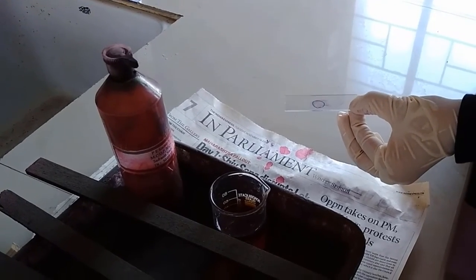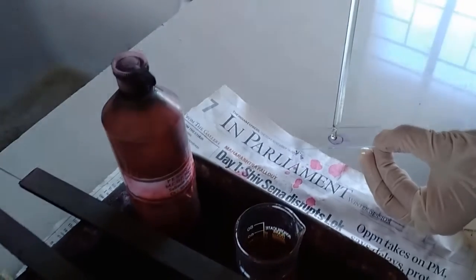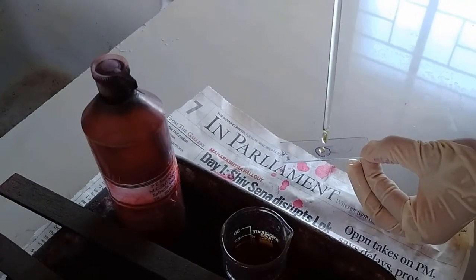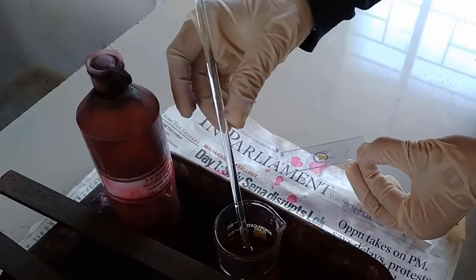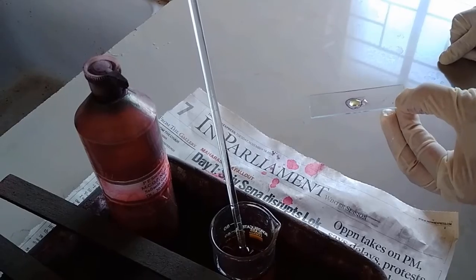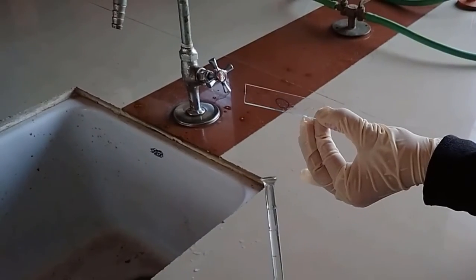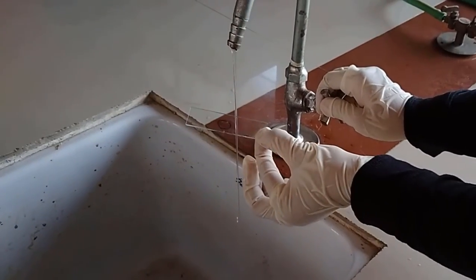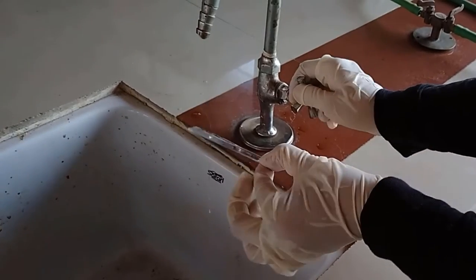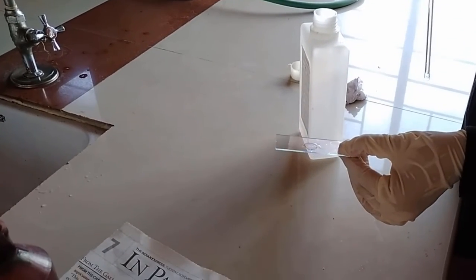Now we will be adding the gram iodine stain into it. 2 to 3 drops of gram iodine stain. And retain it for 1 minute. Adding the gram iodine stain, we'll wash it off with water and allow it to dry. Now we have completely dried the slide.